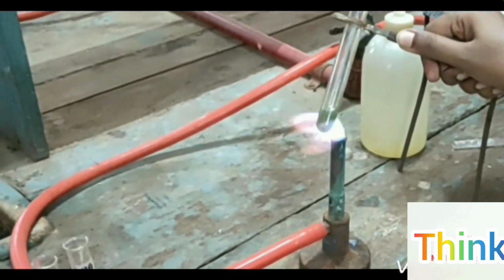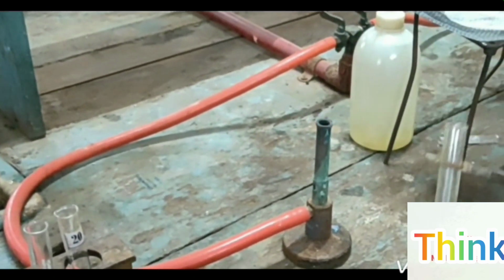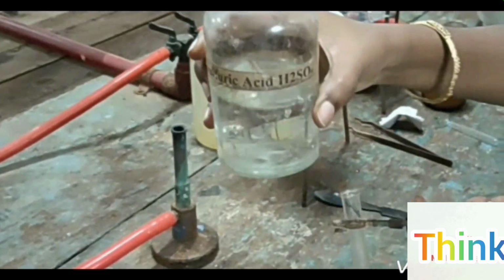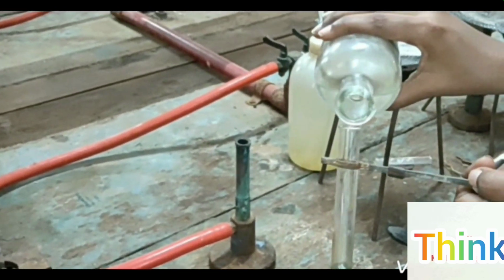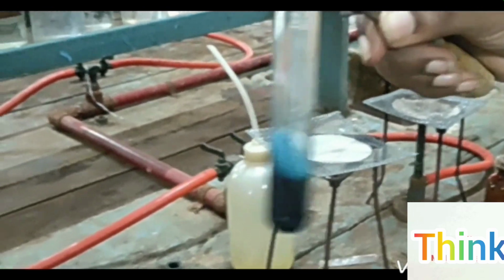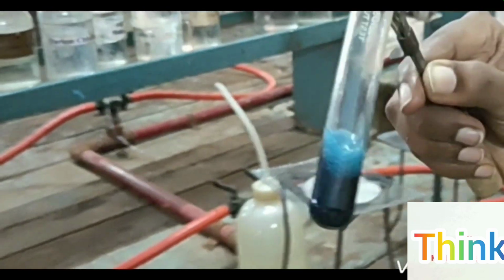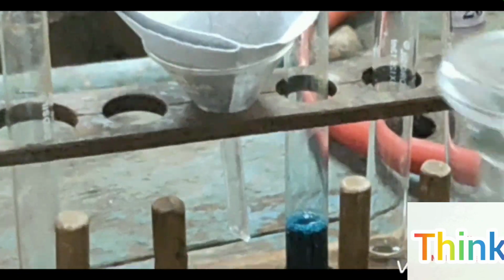After adding freshly prepared ferrous sulfate solution, we have to heat it to boiling, and we can add 2-3 drops of acid. After adding 2-3 drops of acid, what happens?